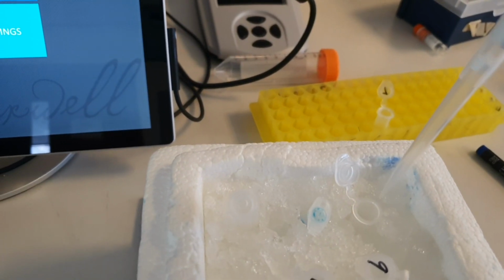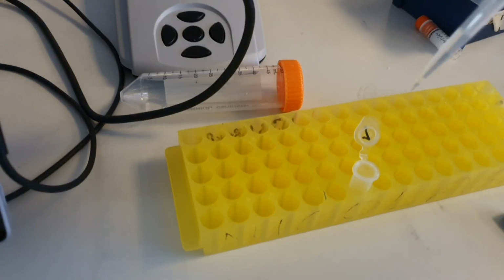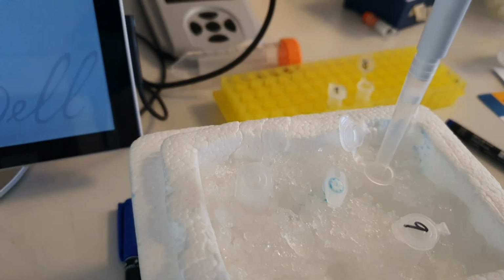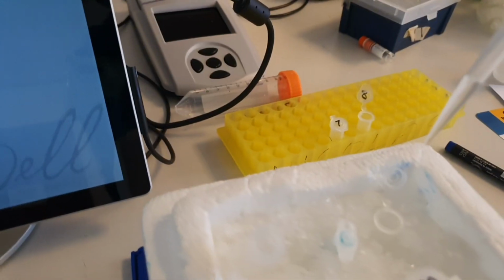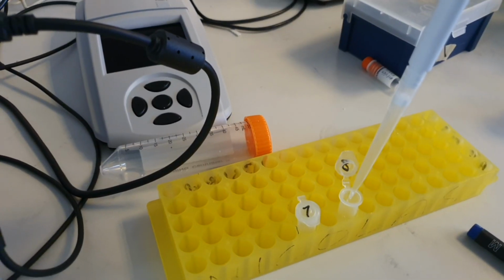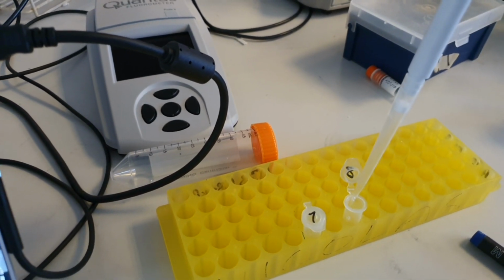In each sample we'll add 200 microliter of thioglycerol working solution, and make sure you lyse the cells very well. Similarly, we'll proceed with the other samples: 200 microliter of thioglycerol working solution to the cell pellet and mix well. You can also vortex it to make a nice homogeneous solution.